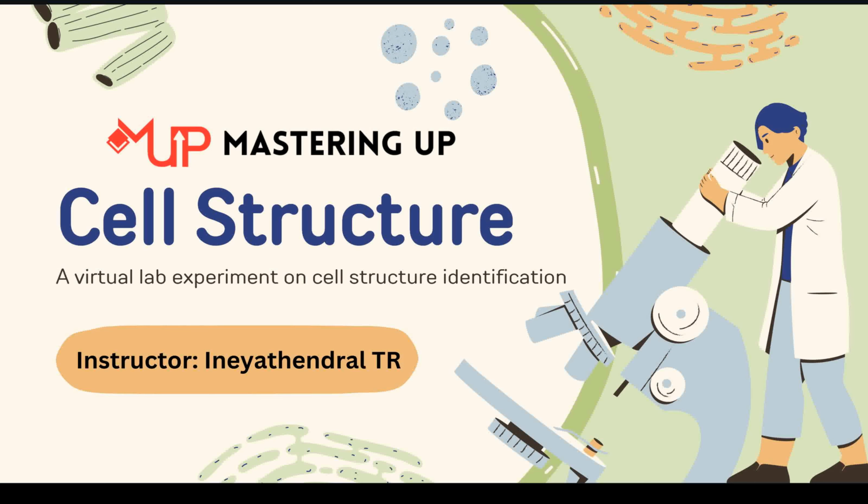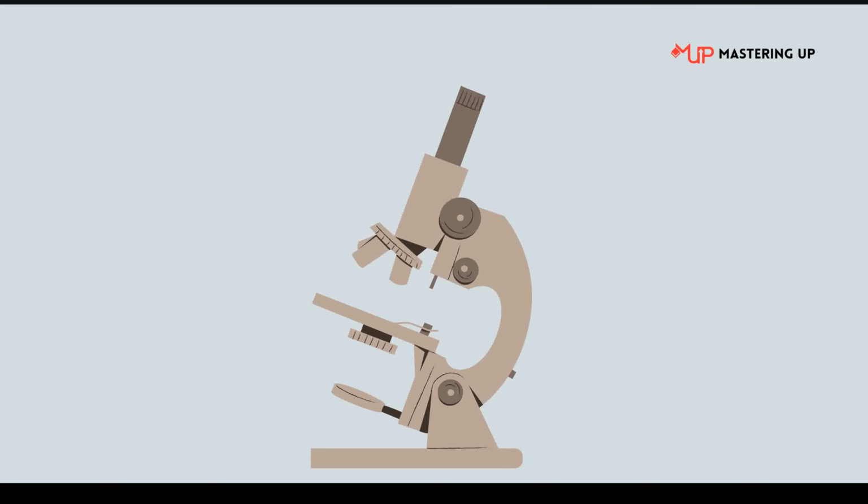In this video, we will see a virtual microscope experiment where we will explore and identify the intricate structures of cells. Microscopy has been a key tool in biology, allowing scientists to observe the smallest unit of life, cells.